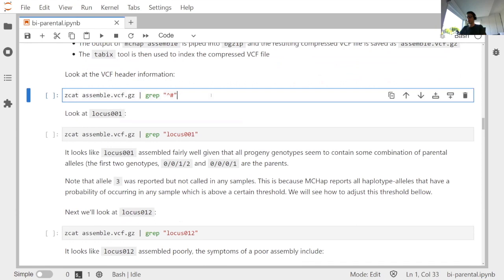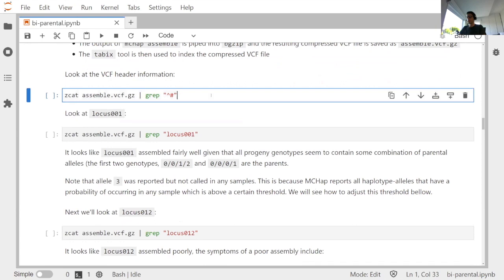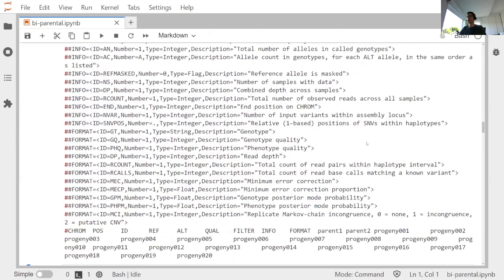Looking at the header data from the MCHAP assemble output, we store a lot of metadata about how the VCF was produced: the date it was produced, the version of MCHAP, the exact command used to create the VCF, and the random seed used for the Markov chains. There is a lot of information stored in the VCF itself about how it was produced, followed by metadata fields with short descriptions of what they contain.